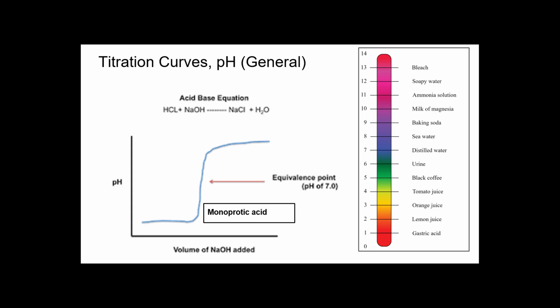You're not asked to know this, but I wanted to explain how a pH indicator works. You will definitely get to know more of this in 24B. With us being online, I don't know, but if you weren't, you definitely would get to know these. These are titration curves. It starts out with the acid, usually around pH 0, and sodium hydroxide is added.